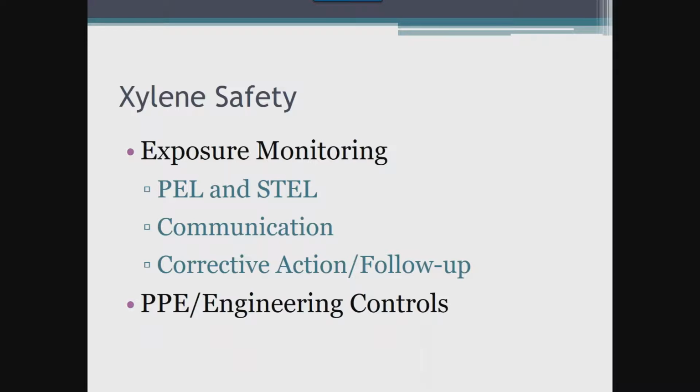Xylene is a colorless, flammable liquid with a sweet odor. Exposure to xylene can irritate the eyes, nose, skin, and throat. Xylene can also cause headaches and dizziness. There is a requirement to monitor xylene fumes initially, but there is no requirement for periodic monitoring. Laboratories should consider repeat monitoring when there is a change in production equipment, processes, more people added to a space, or control measures that are likely to increase or could possibly increase exposure levels.